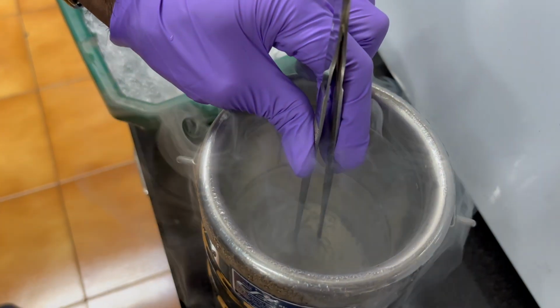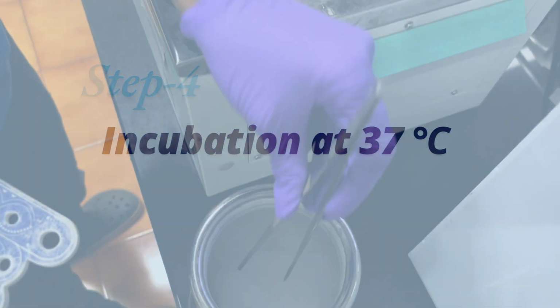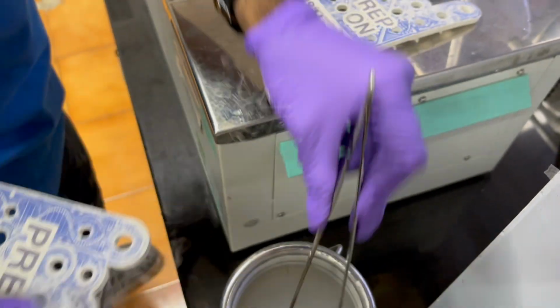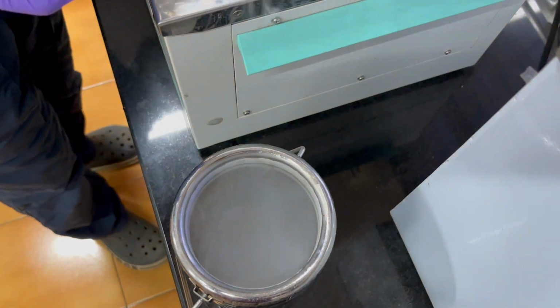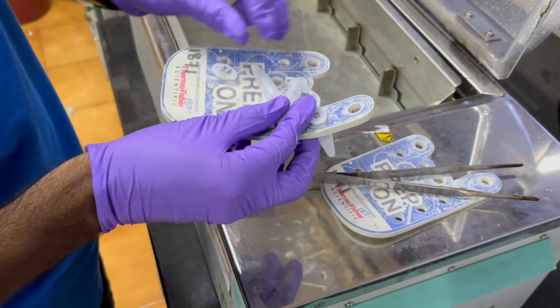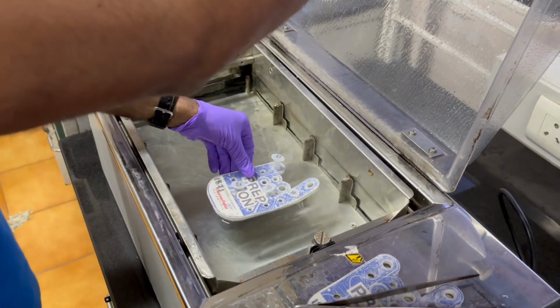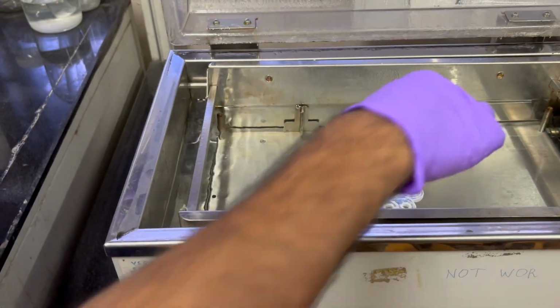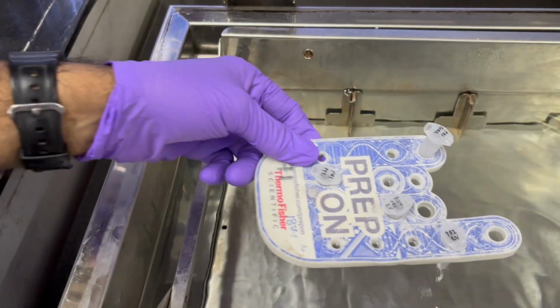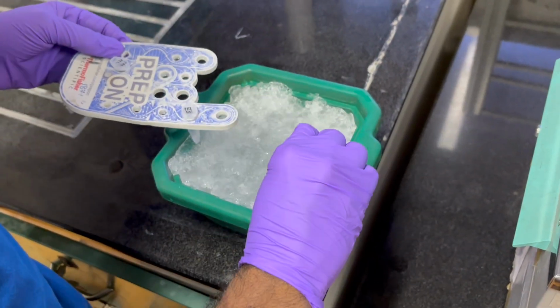Make sure you are wearing all the protective gear. Freezing disrupts the bacterial cell membrane and creates transient pores. After freezing the cells in the liquid nitrogen, we immediately take out the cells and incubate them in the water bath for 5 minutes at 37 degrees Celsius. So the transient pores which are created on the bacterial cell membrane are now able to take up DNA after thawing, and this is the rationale behind the freeze-thaw method.